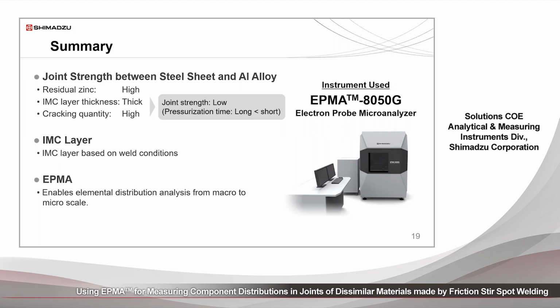The IMC layer was observed using the EPMA 8050G, and both the IMC layer thickness as well as the IMC layer composition were measured with the EPMA. To summarize, the EPMA enables elemental distribution analysis from the macro to the micro scale.